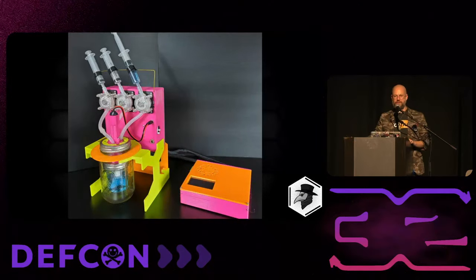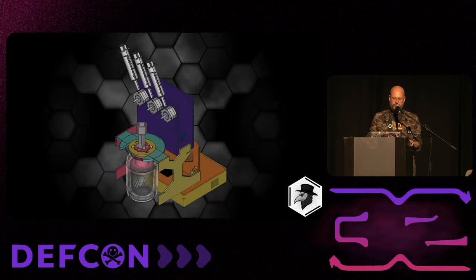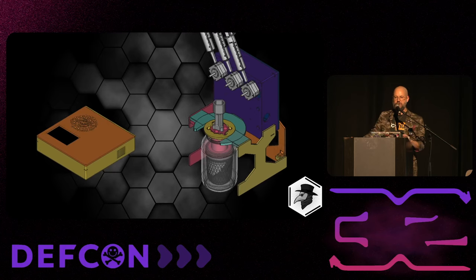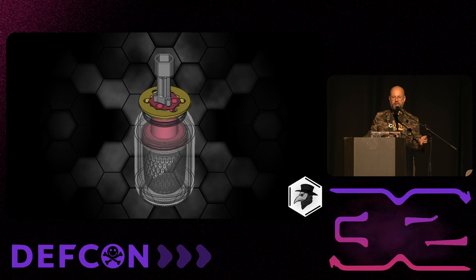Here's the machine itself. And again, you're looking at one of them to the left. And let's look at the pieces. So you have the reaction chamber itself. This is two mason jars, one which sits within the other. And there's a 3D printed armature. It's called the reactor core, which allows these to screw together so that the inner jar floats while the outer jar can have the circulating fluid.